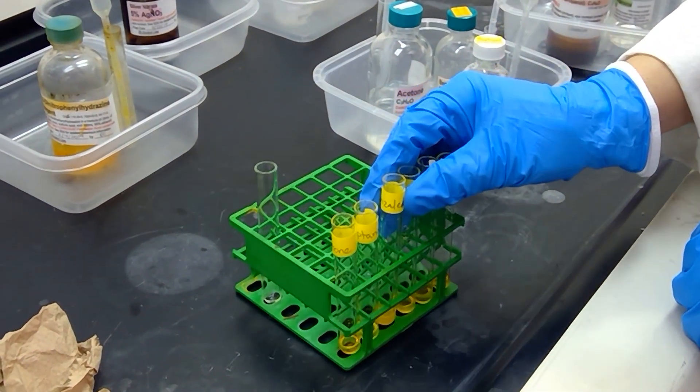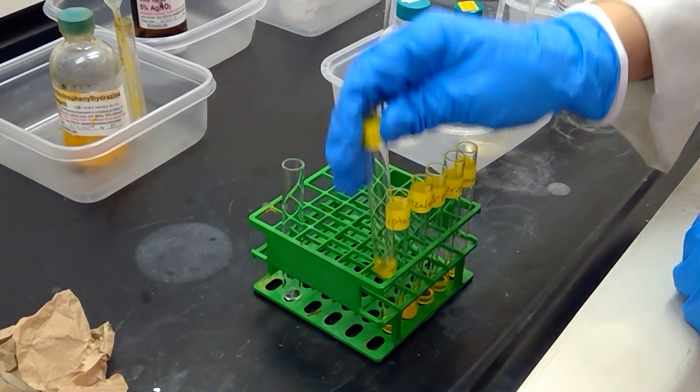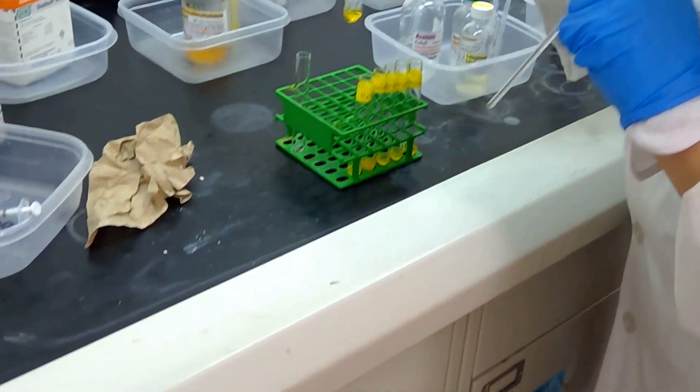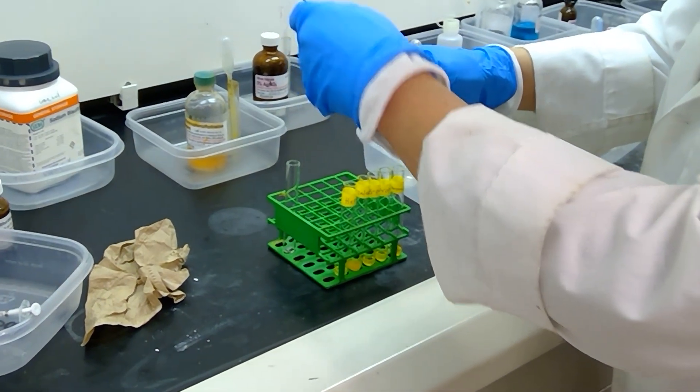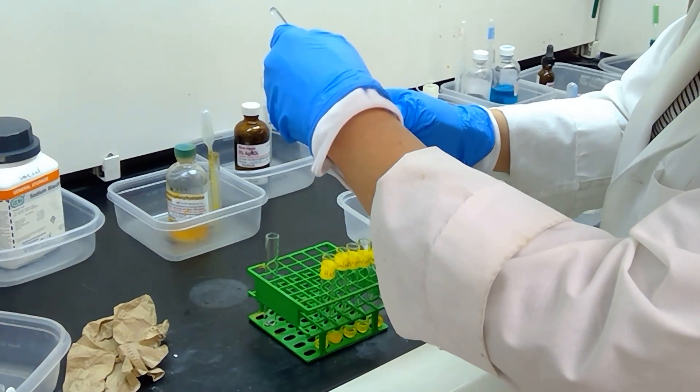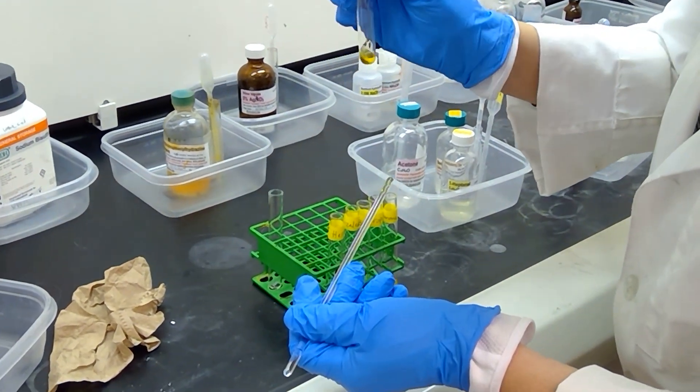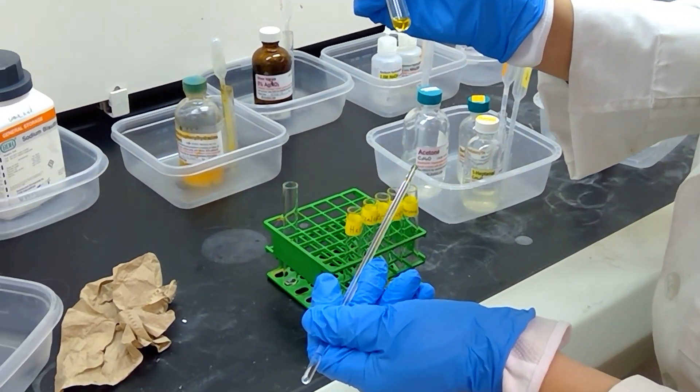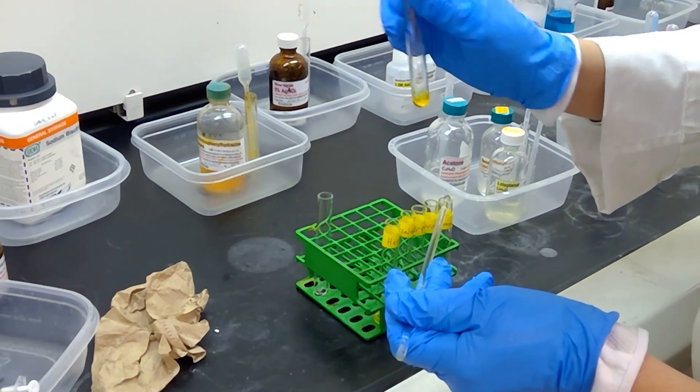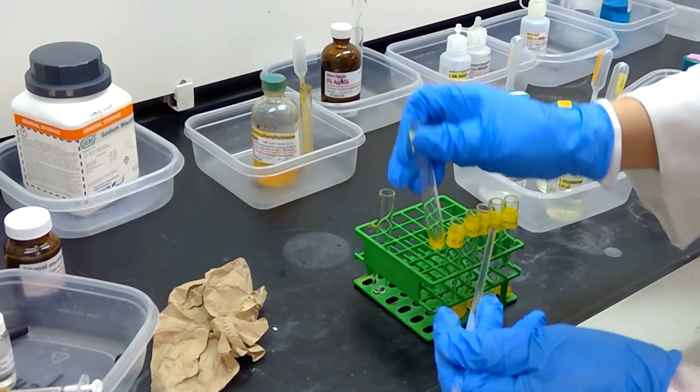Next up, what I'm going to do is scratch each sample slightly with my glass rod here. I'm starting with the acetone sample to see if I can increase that precipitation. Well, the precipitation isn't really increasing, but the slight orange flecks are pretty visible.